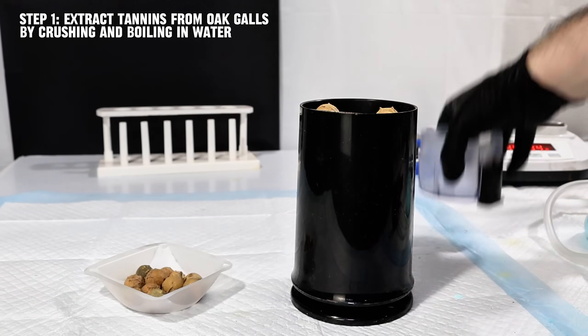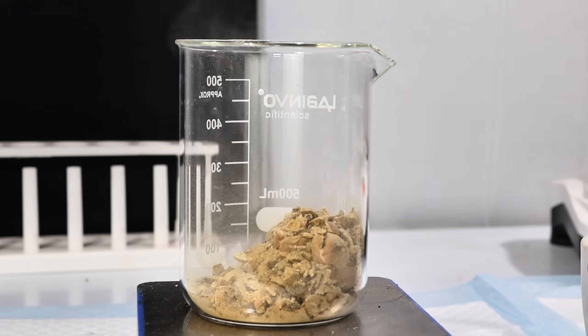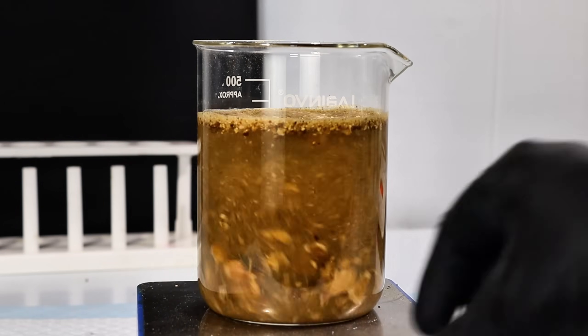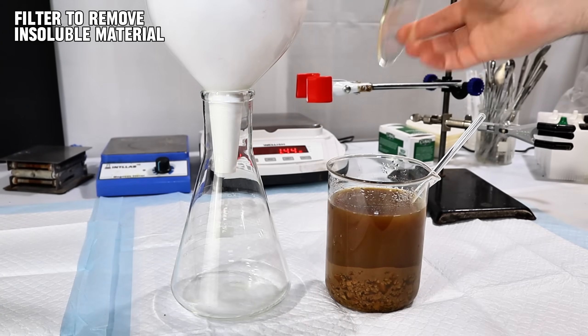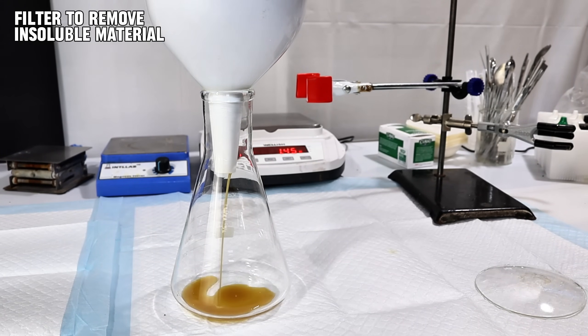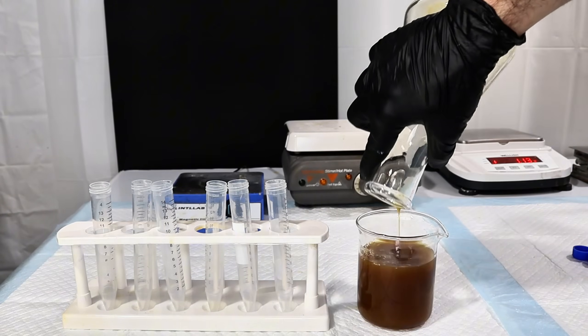To extract the tannins, I simply crushed a few of these oak galls and then boiled them in water for about 30 minutes. During this time, the majority of the water-soluble tannic acids were dissolved into the water, and so I simply allowed the mixture to cool and then passed it through a coffee filter to remove the insoluble plant material. This left me with a dark brown solution of tannin extract, which is one of the two ingredients for my iron gall ink.